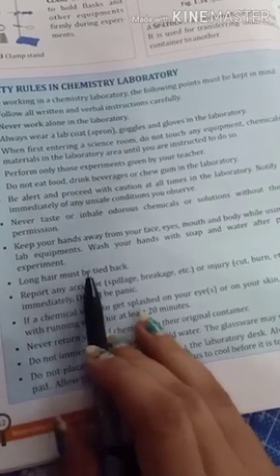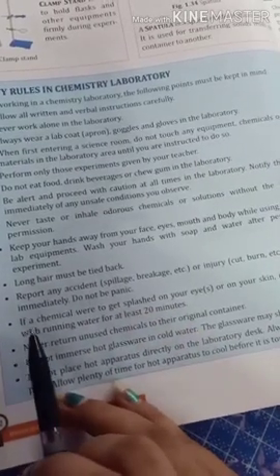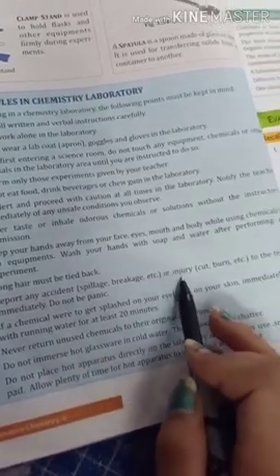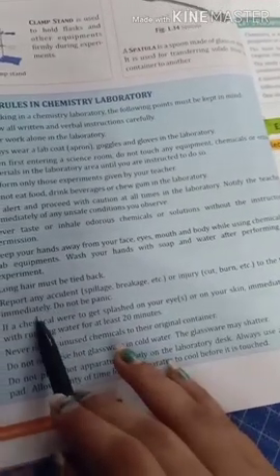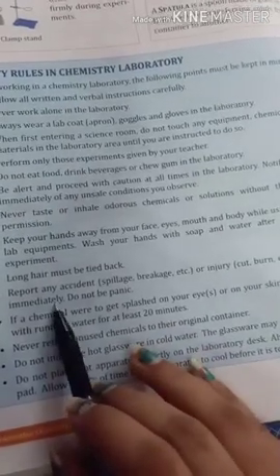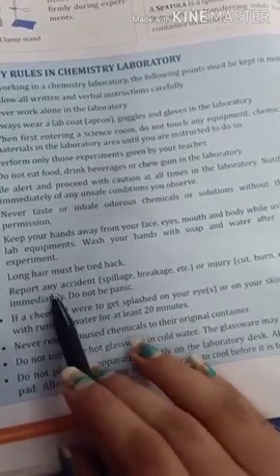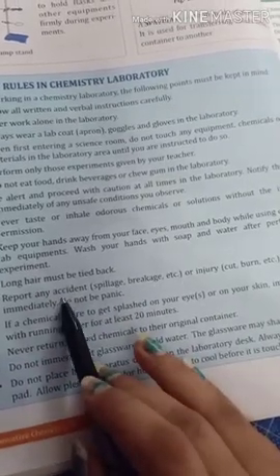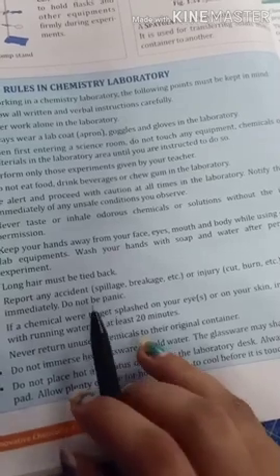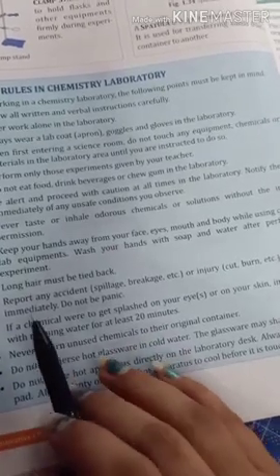Long hair must be tied back. Report any accident or injury to the teacher immediately. Do not panic. So if you observe that there is any accident or you have any injury, then immediately inform your teacher.